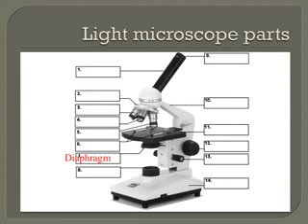The last part of the microscope that you may need to use from time to time is referred to as the diaphragm. As I mentioned earlier, light passes through a small hole on the stage of the microscope. The size of that hole can be enlarged or made smaller by manipulating the diaphragm. The diaphragm often looks different from microscope to microscope, but it will almost always be found below the stage of the microscope. If what you're looking for under the microscope is too bright or too dark to see things properly, you can try to adjust the diaphragm.